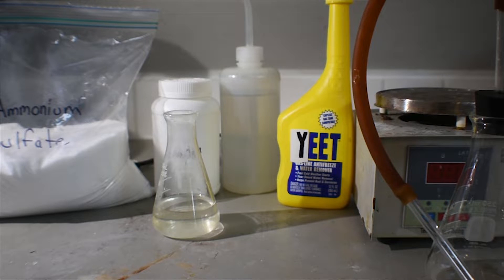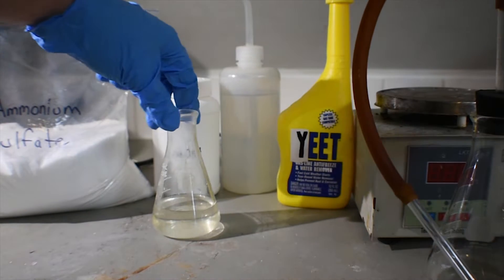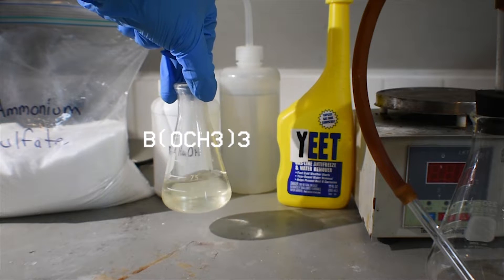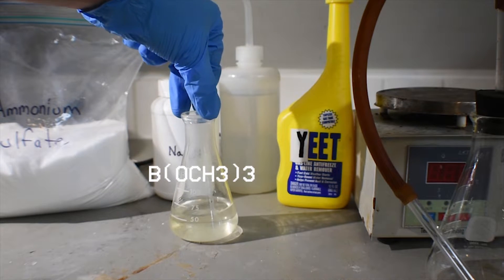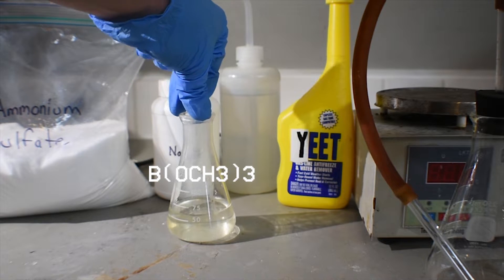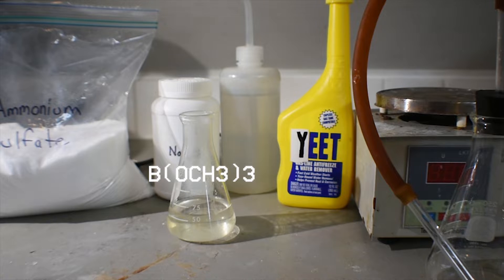This synthesis is a very simple one. All you will need is, of course, trimethylborate. Here I have a mixture of 75% trimethylborate and 25% methanol prepared by Corrosive Chemistry's video — go check it out, I'll leave a link here.